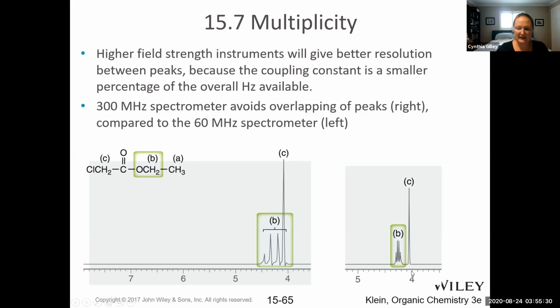But if you take the same one chemical shift range of 4 to 5 and you use a 300 megahertz instrument, you can break it up into 300 equal slices, and you can assign values to any of those 300 different equal slices. There's just more to go around here, so the likelihood that they will have the same exact radio frequency value that it absorbs is a lot smaller when there's a lot more resolution, or a lot more pieces of the pie, so to speak.